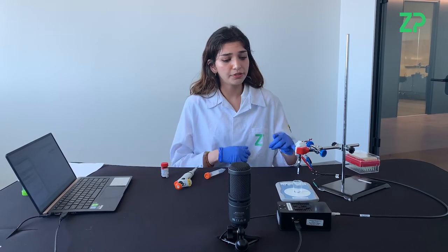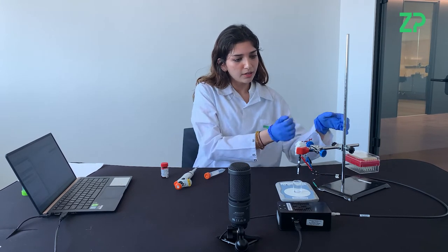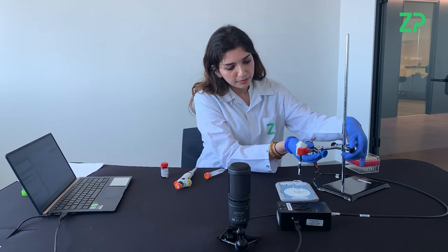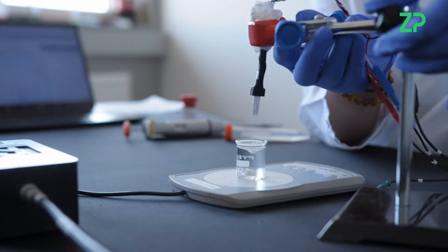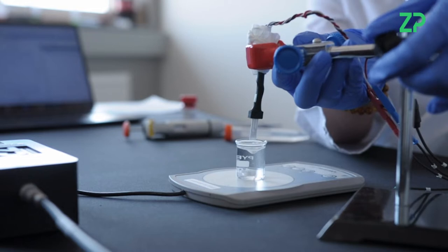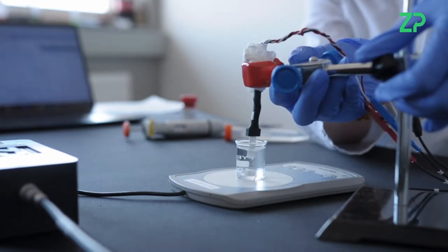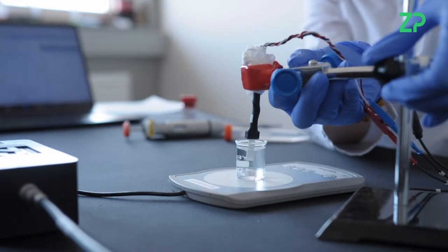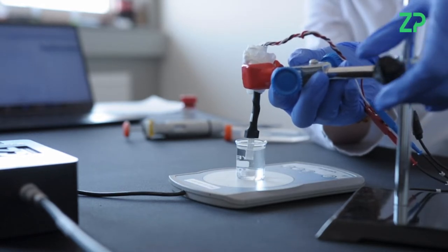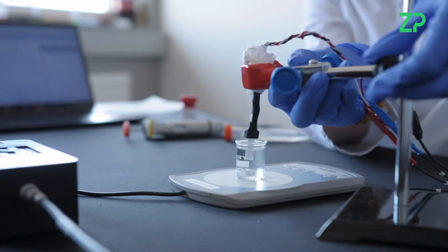First I'm going to immerse the sensor in the PBS, so I will push this down. It's important to have all three electrodes immersed into the PBS as well, and it's also important for this experiment to use lactic acid and not sodium lactate, otherwise it won't work.